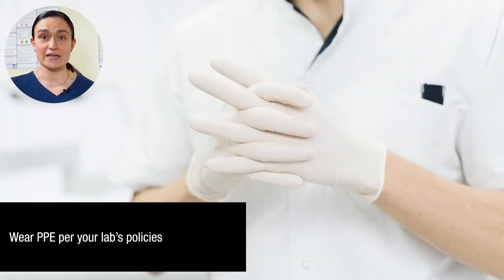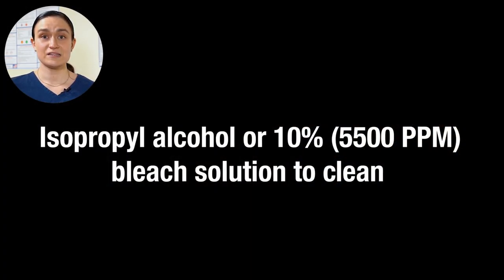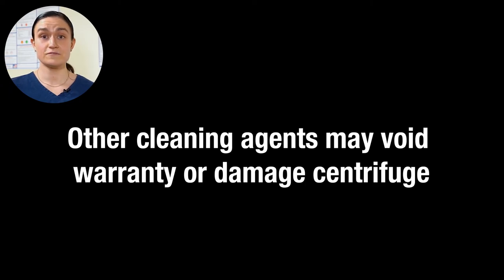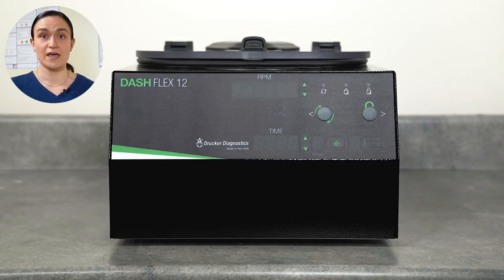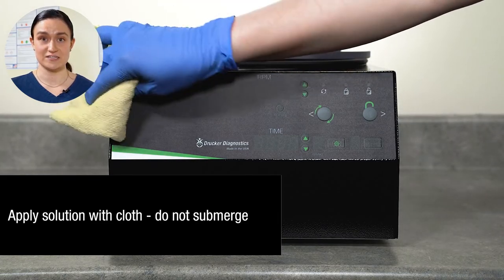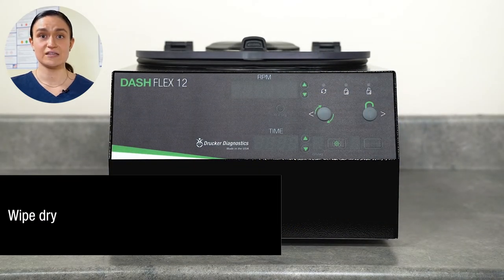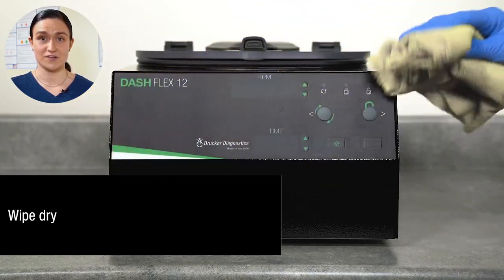Next, make sure that you're wearing any appropriate personal protective equipment as determined by your lab. When cleaning the Dash Flex 12, you should only use isopropyl alcohol or 10% bleach solution at 5,500 ppm. Use of any other material may void the warranty and damage the centrifuge. Do not submerge the centrifuge at any point during the cleaning process. Instead, apply your cleaning solvent to a clean cloth and wipe down the centrifuge and its components. Once you are done wiping down the centrifuge, immediately use a clean dry cloth to wipe off your solvent again.